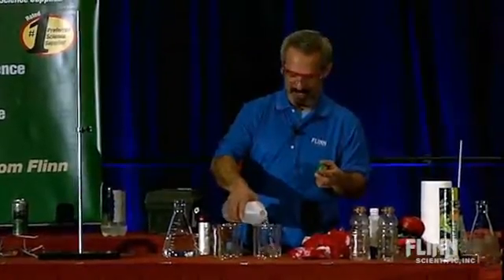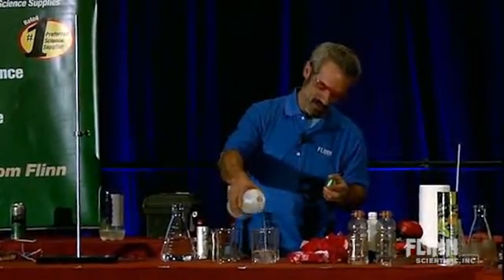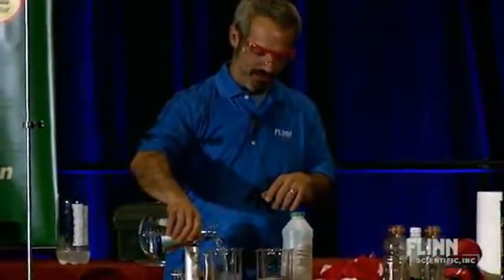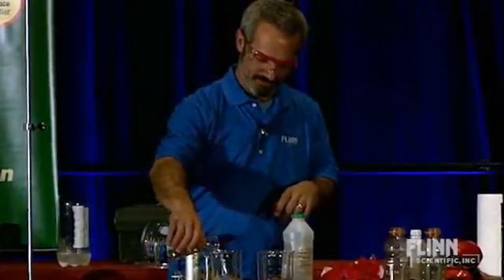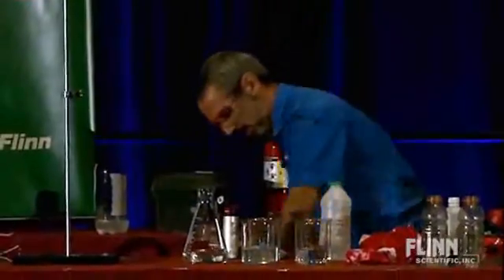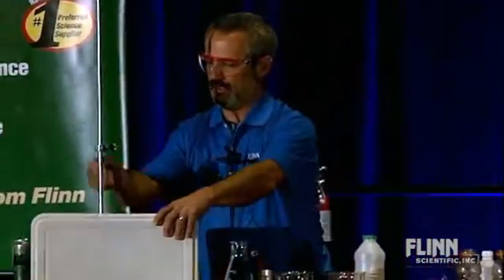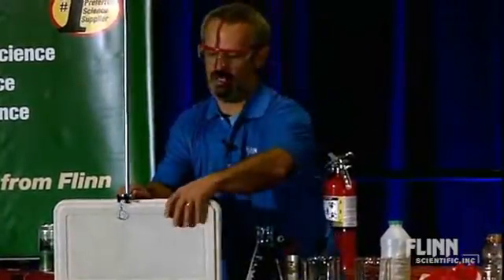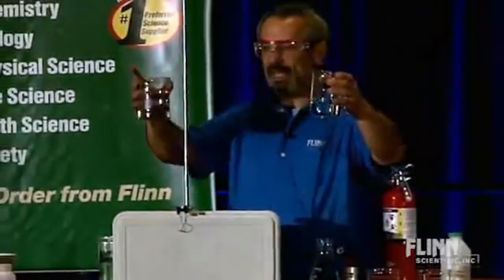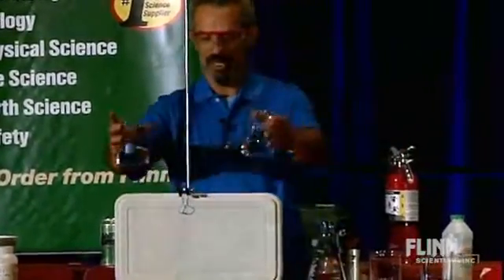We want the lights on for this one. So I'm very carefully measuring out some solution A, and equally careful with my measuring out of solution B. And I'm going to use that cooler top just as a little backdrop here. That'll work. So, what happens when you mix A and B? You might not see it against here or the dark background, so let's find out.